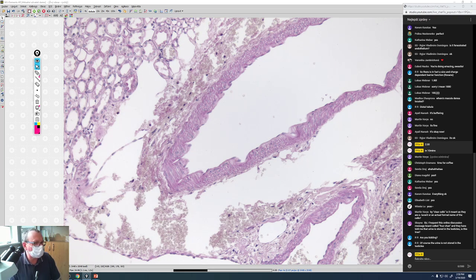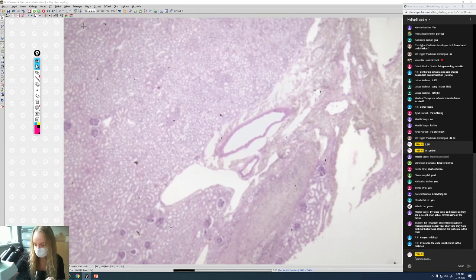Let's go to the ureter. So will we change again? Yeah. Andrea is again ready to demonstrate ureter. These are the last two slides for me, and the one last slide you're going to describe, and also development of the urinary system. So these are two last slides for me. First is ureter. Okay, I'm going to change this.